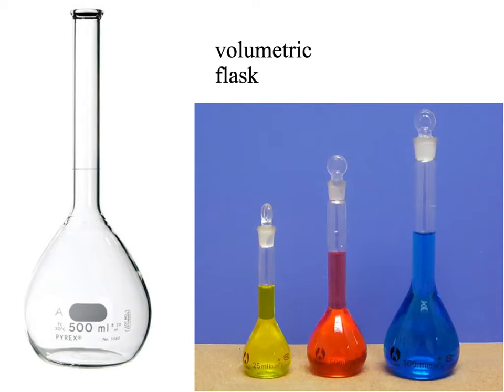Volumetric flasks — again the word flask tells us it's going to be storing liquid. The word volumetric implies volume. These hold a very specific volume of fluid — that's their function. If you notice, this flask has only one line, or one calibration.